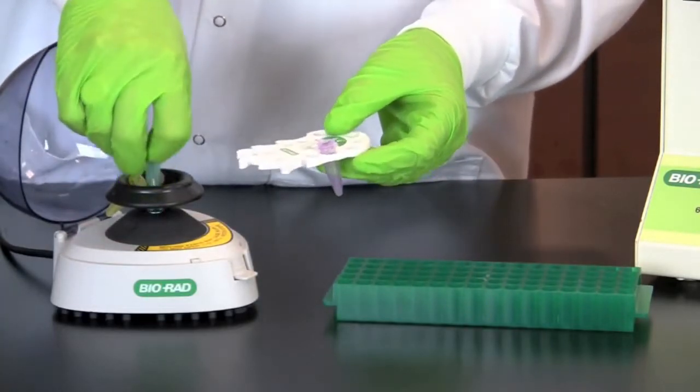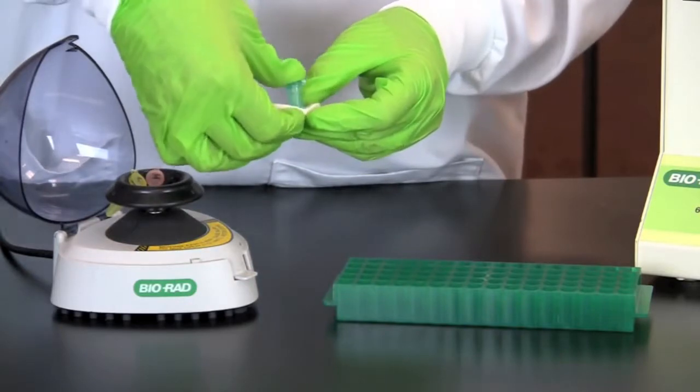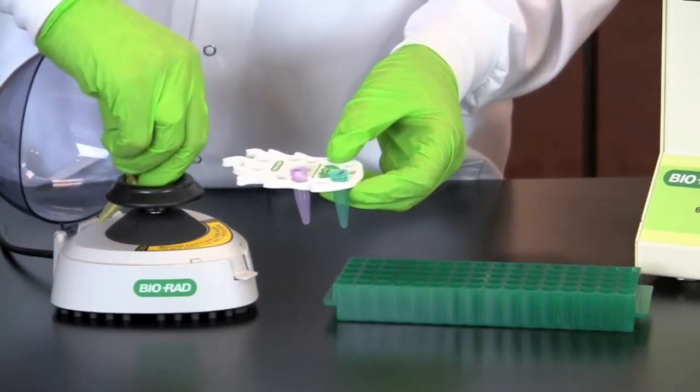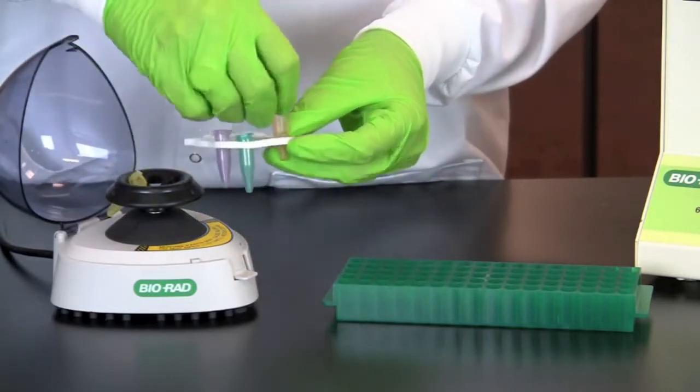After spinning the tubes, place the tubes in a rack and incubate for 30 minutes in an incubator or water bath at 37 degrees Celsius, or overnight at room temperature.